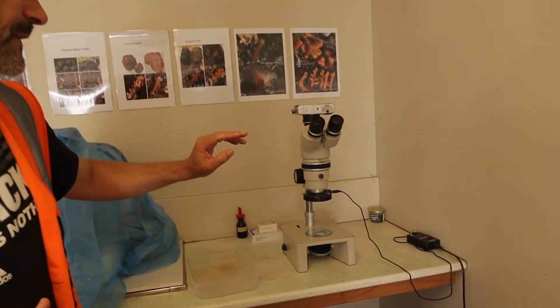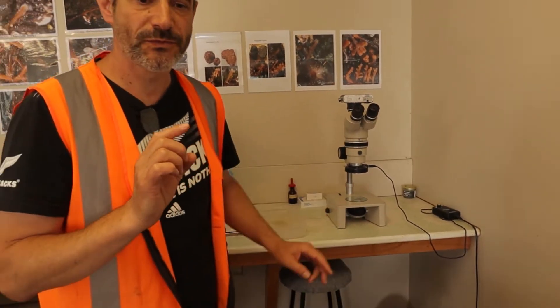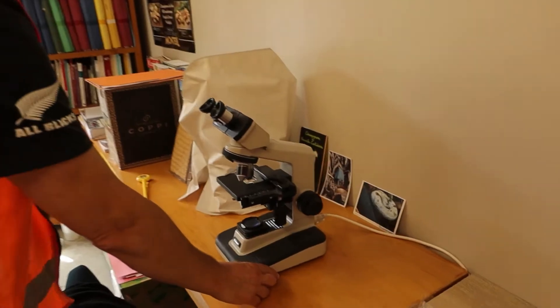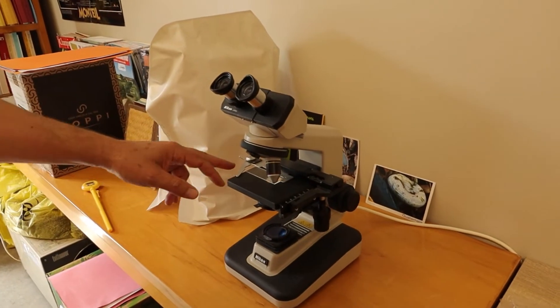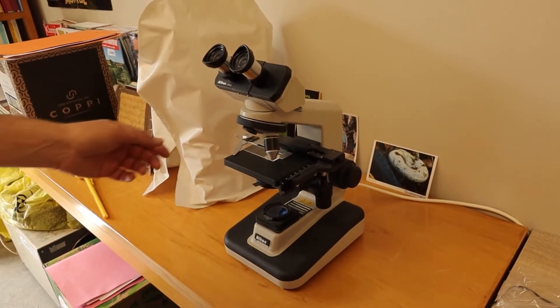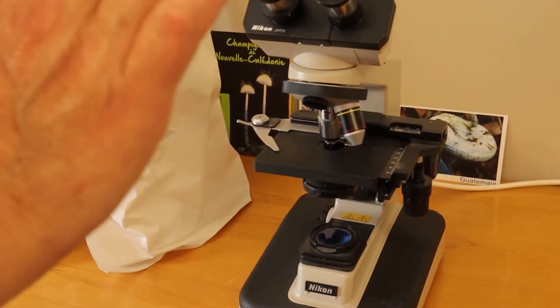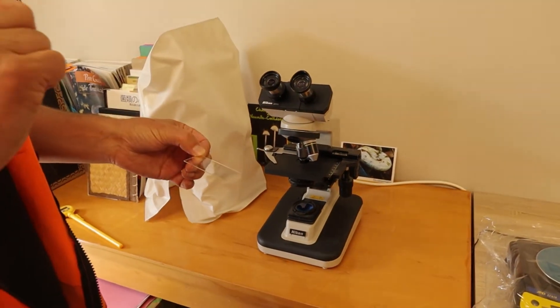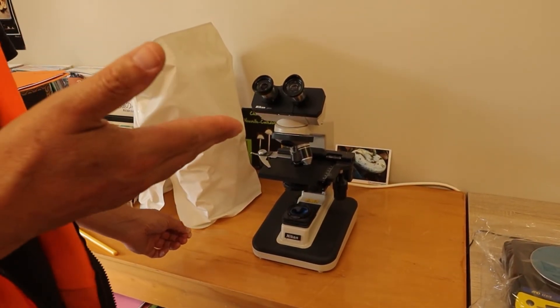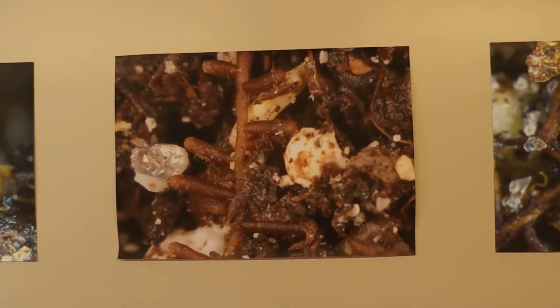In the case of truffles, you start with the stereo microscope, but often we need to look at finer detail, so we use what we call a compound microscope, which can go in theory up to a thousand times. Here I have a lens that goes to 400 times. You use a microscope glass and a cover slip, squeeze the root you think is a mycorrhizae, and with that microscope you can check finer details that will confirm it is indeed the one you were thinking. It's a double-step process.